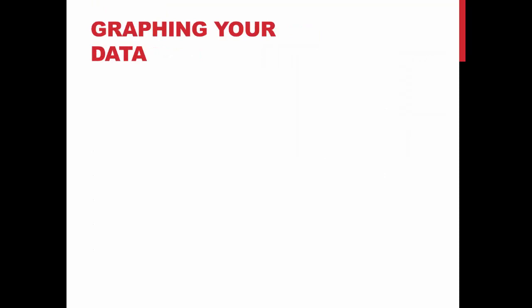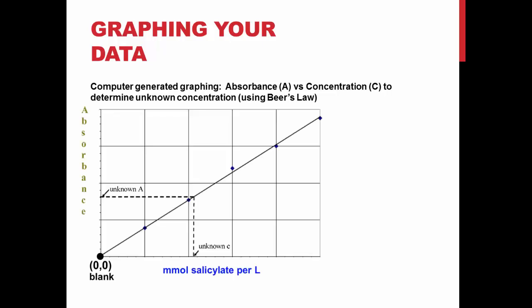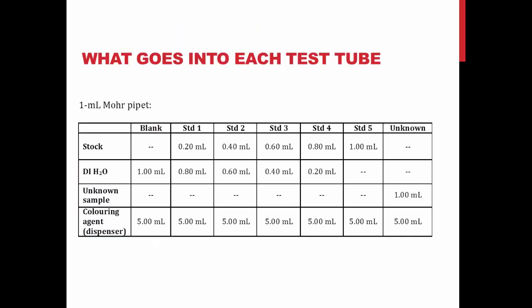Then you will graph your data into a calibration curve. Graph absorbance versus concentration to determine the unknown concentration of your salicylate solution. The graph should look as follows — note that there are a few things wrong with the example graph shown. Be sure to review the 'How to Graph in Excel' video to make sure you have everything you need. With your data, you will be able to find the concentration of your sample based on its absorbance. Here is a summary of what goes into each test tube — make sure you write this down in your data book so you can refer to it during the lab.